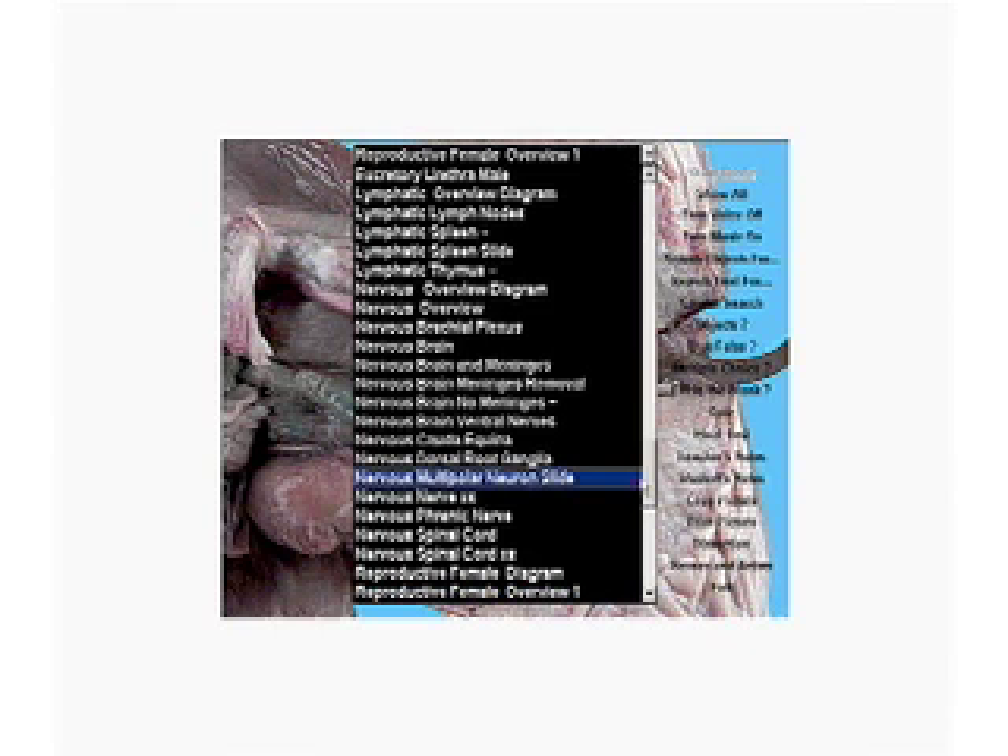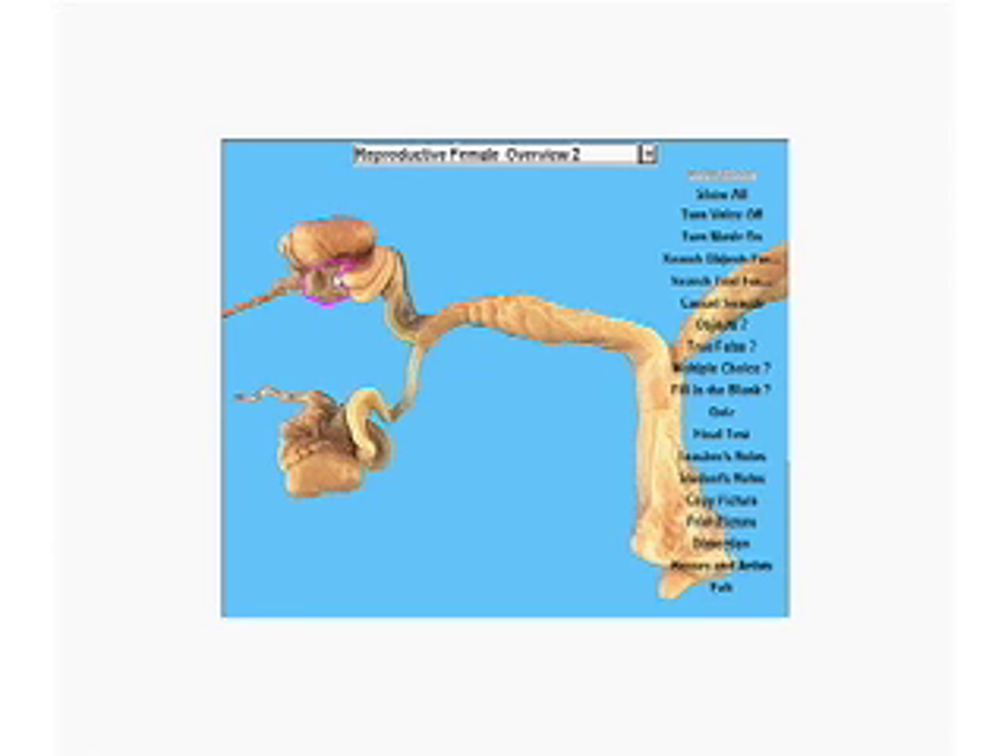The developers of this software have come up with an ingenious idea. They took out the female reproductive tract en bloc — meaning in one piece — so we can study it in isolation without all of the other structures confusing us. Here's one ovary, and here's the other ovary. This is the fallopian tube — oviduct. And this is the uterine horn. The pig has a bicornuate, or forked, uterus. She can have three or four piglets on this horn and three or four piglets in this horn. Here's the rest of the uterus. This swelling is the cervix, where humans get pap smears. Here's the vagina. And next to it is the urethra. So the urethra and the vagina fuse to form the urogenital sinus — which is that second opening we saw below the anus on the butt shot. And next to the urogenital sinus is this little tag of tissue: Genital Papilla.